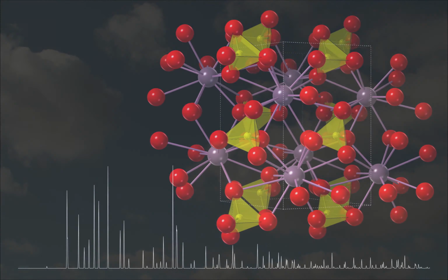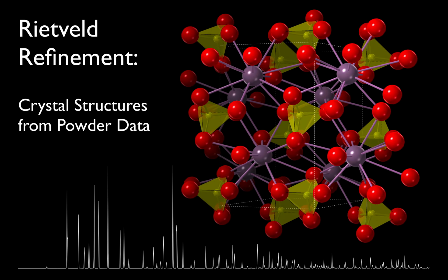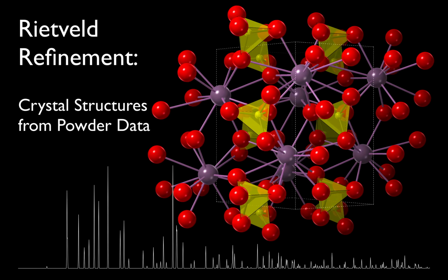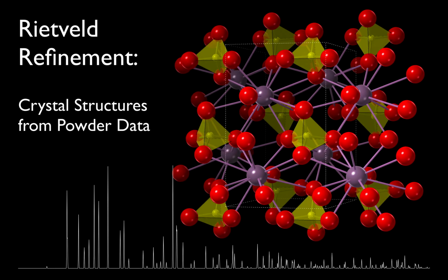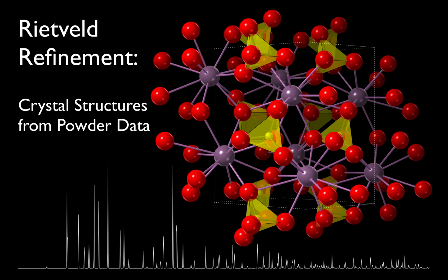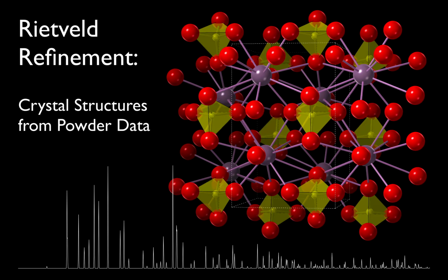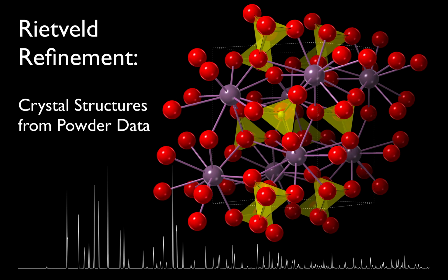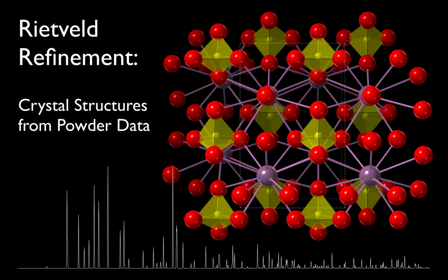Welcome to CrystalDiffract 7. In this tutorial we're going to demonstrate basic Rietveld refinement for lead sulfate. Rietveld refinement is essentially a curve fit, refining an existing and reasonably known starting structure relative to an experimental dataset. So we're going to need a crystal structure and an observed pattern.